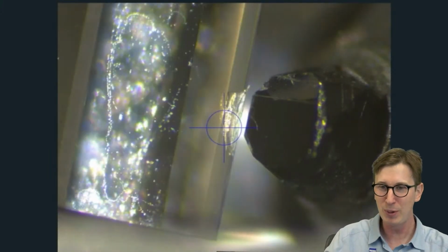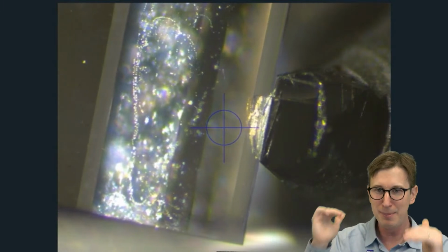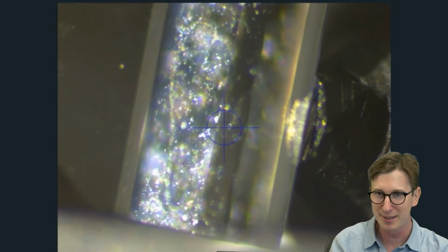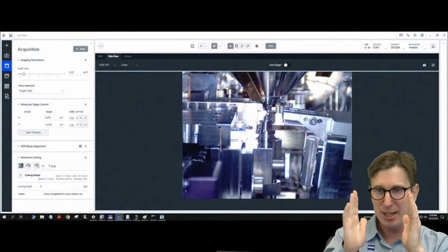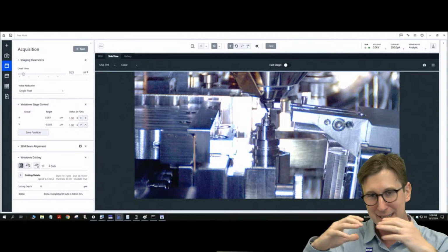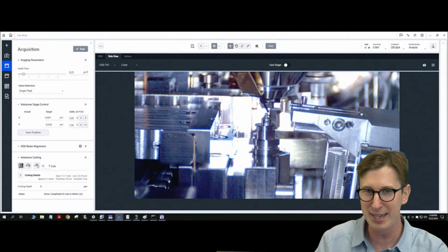And that is what's going to give us that great resolution in the Z dimension. Here's one final cut, just polishing off that block face. That really precise motor in there is what allows us to get that Z depth, and we can actually cut as thin as 25 nanometers once we have the sample in.